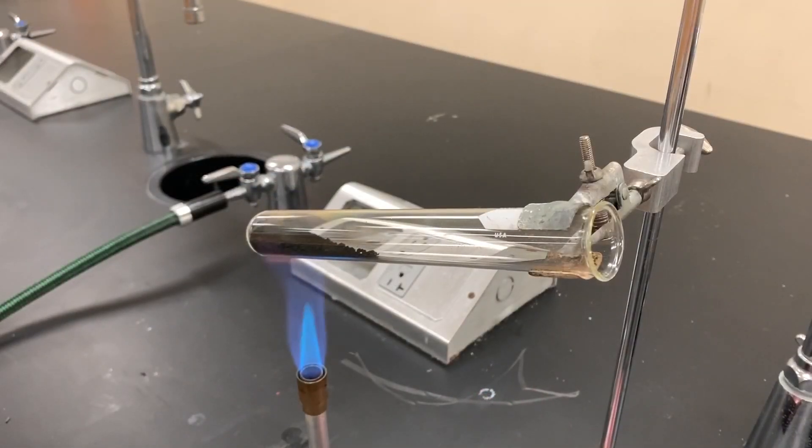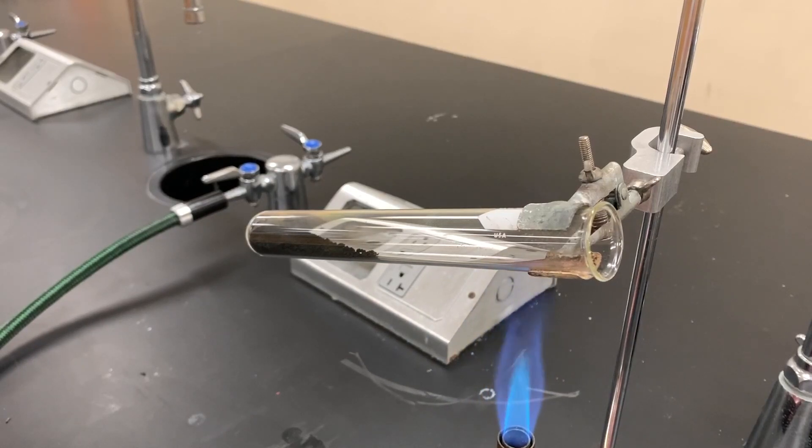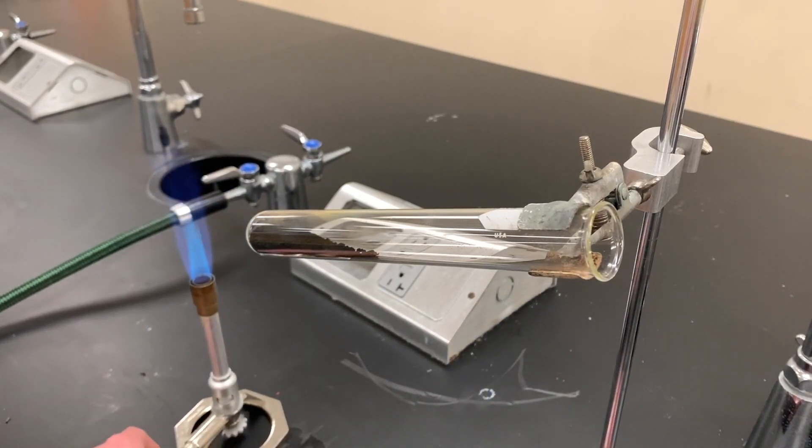I've used my Bunsen burner to drive off all the water that was in the upper portion of the test tube, so that looks like it's gone. The last thing I have to do is safely turn off my Bunsen burner and clean up.